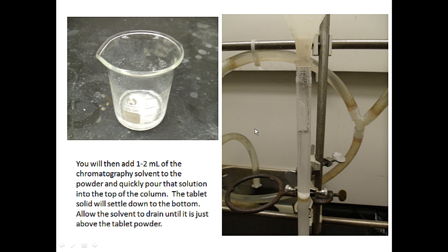Then you're going to add 1 to 2 mils of that 10-to-1 chromatography solvent in order to dissolve most of the components of the Excedrin tablet. Now remember, there's a binder in here that will not dissolve. So we let this dissolve for a couple of minutes, and then you stir the solution up and quickly pour it onto the column. When you do that, the powder will settle to the bottom, and then we allow the solution to drain down until it's just above the powder, and then we continue to add mobile phase as the solution drains out of the column.